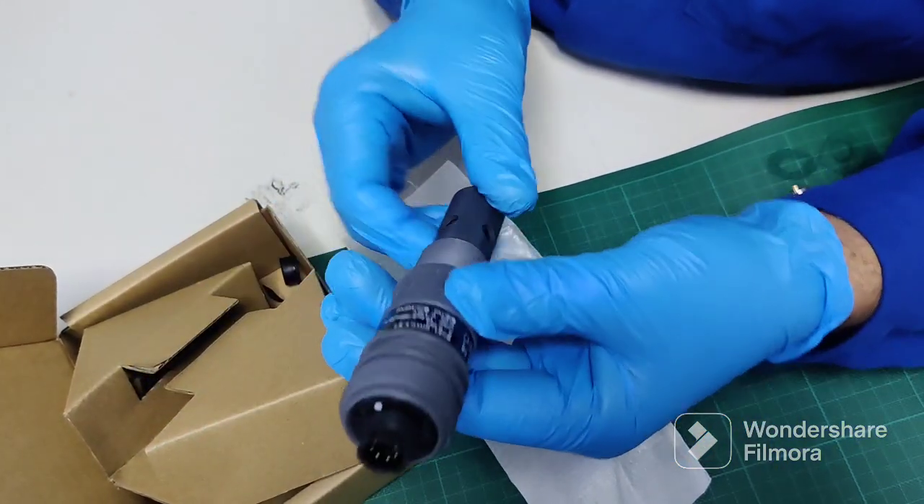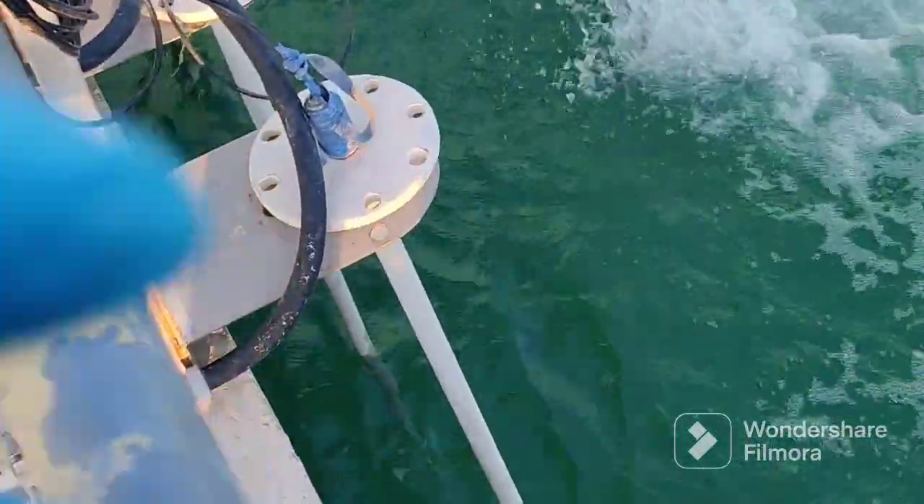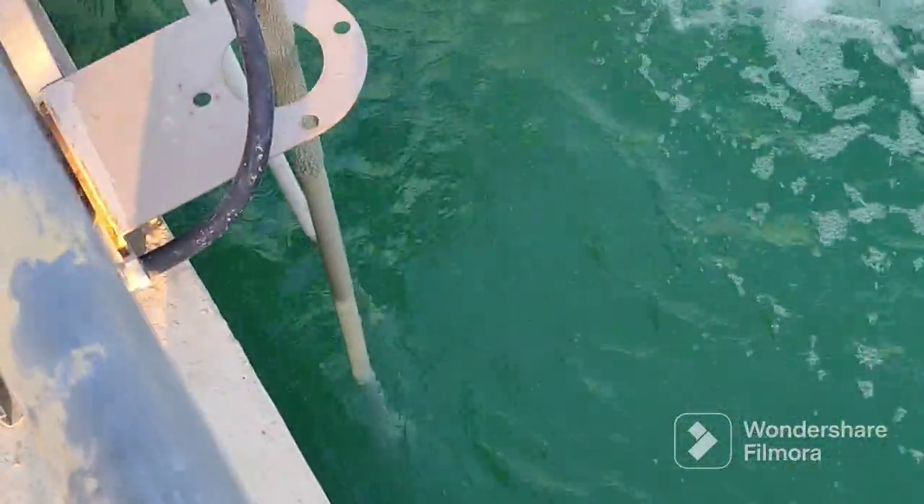Let's go outside and check in the plant where the sensor is connected in the water. Look at the pond level of the water here. There are three kinds of sensors here. This one is for conductivity.